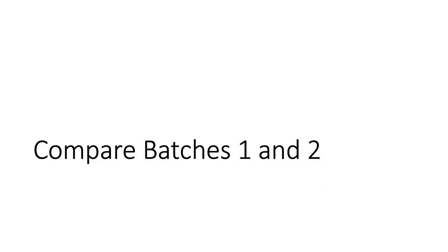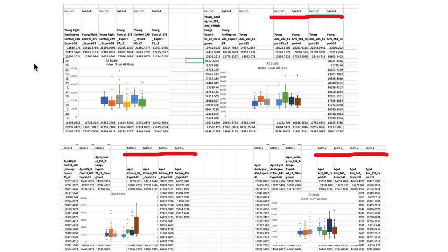All right, for some housekeeping, from last time we increased the sample size, and thus we call it batch 2. I just want to show that batch 2 is comparable to what we found in batch 1. So here from batch 1, our young controls, we had 6 samples, but in our other groups we only had 3, and some of these were from the same animal. We wanted to increase the sample size for more distinct animals, and we did that for all these 3 groups. And as you can see here, comparing the particles from every single group, the data is comparable between the 2 batches.